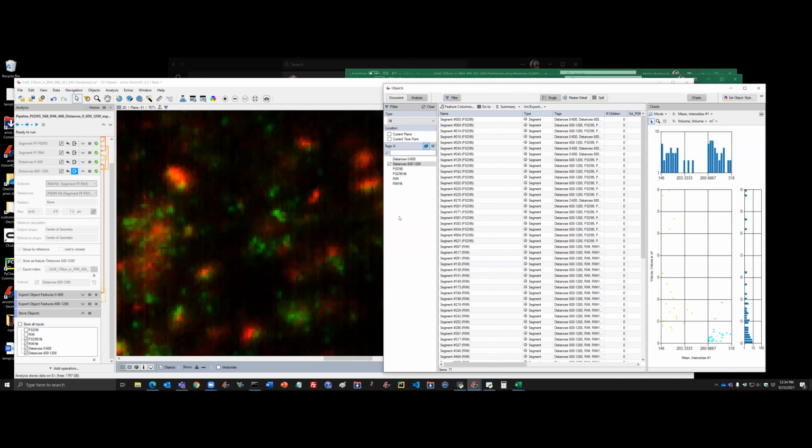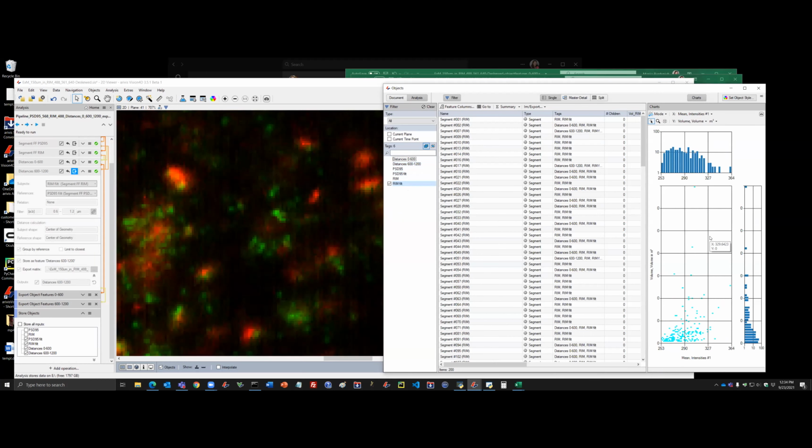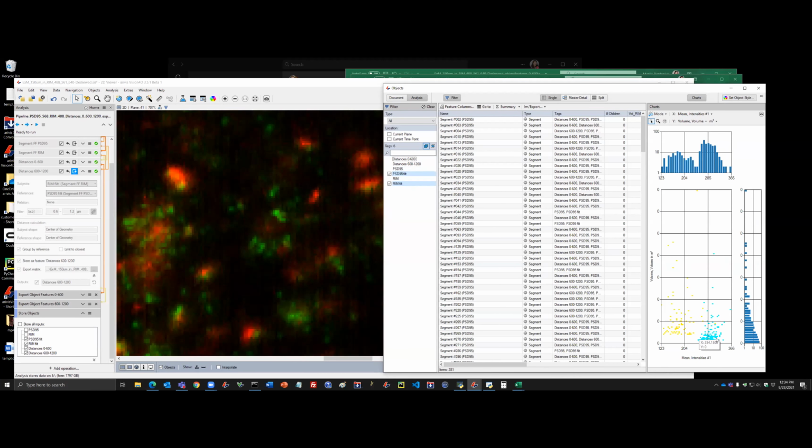What I wanted to show you before is that while we're running the analysis, we can also quickly visualize the quality of our segmentation by, for example, plotting the intensities to the volume values for each of the particle types, even simultaneously. So here the cutoff was higher because we only accepted the particles which are starting from 50 micrometers of voxels compared to the rim particles.